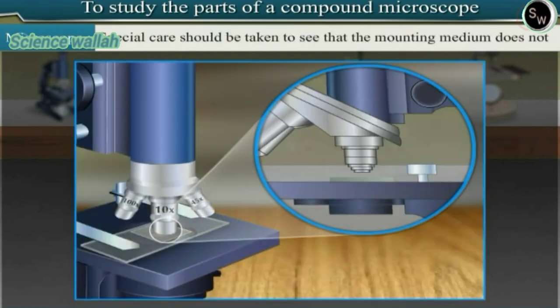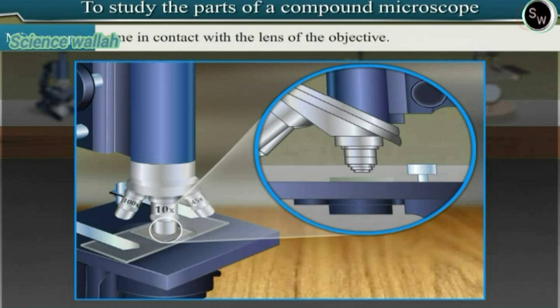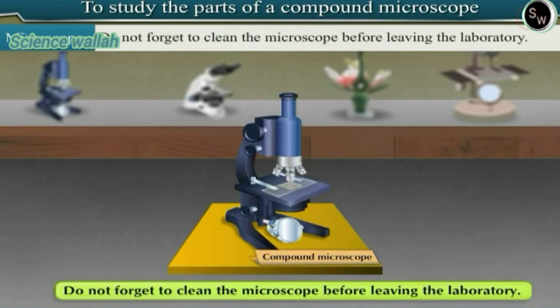Special care should be taken to see that the mounting medium does not come in contact with the lens of the objective. Do not forget to clean the microscope before leaving the laboratory.